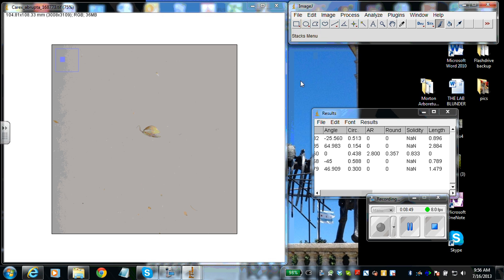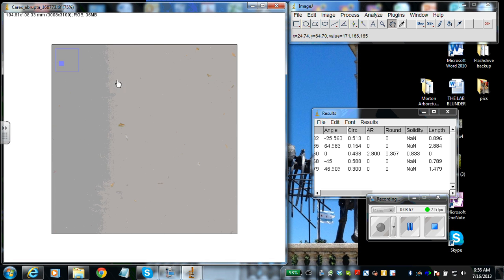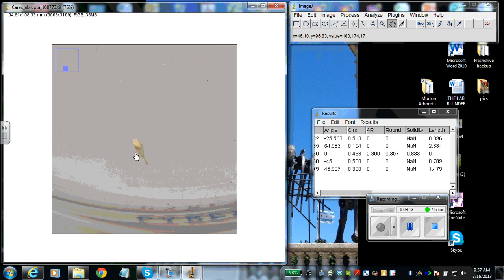So we've got 2. Keep moving around. No, this is debris, right? Scale pieces from the parts of the flower, the inflorescence, the spike that we pulled off. Here's another perigynia, so we're going to mark this one again. Mark. And then continue around our entire petri dish.